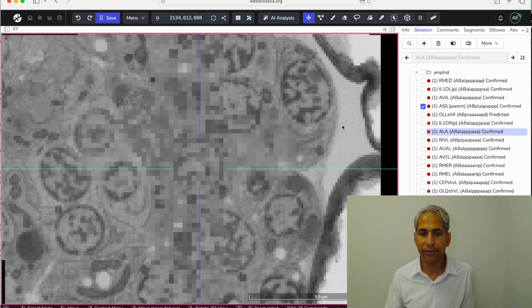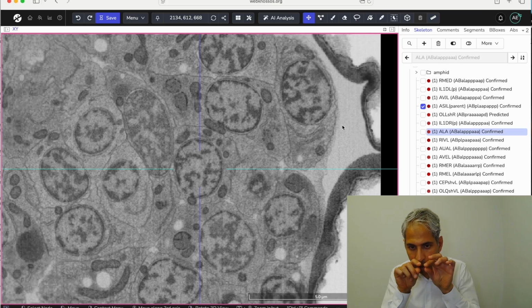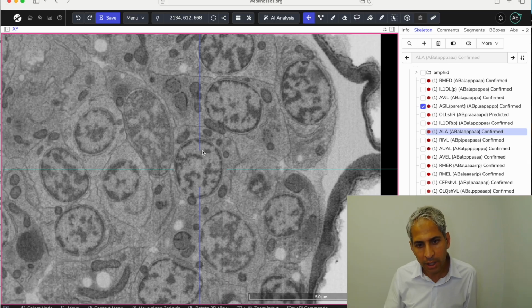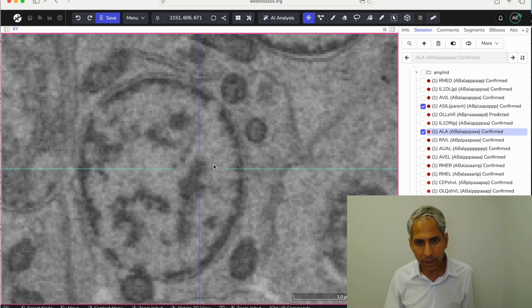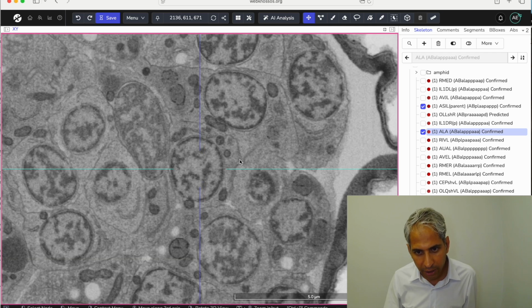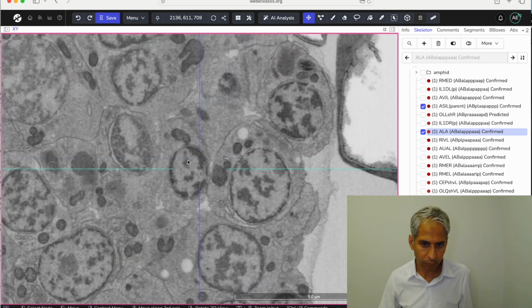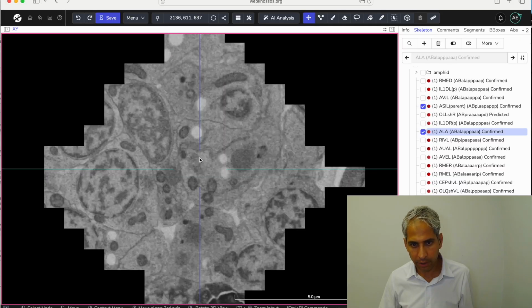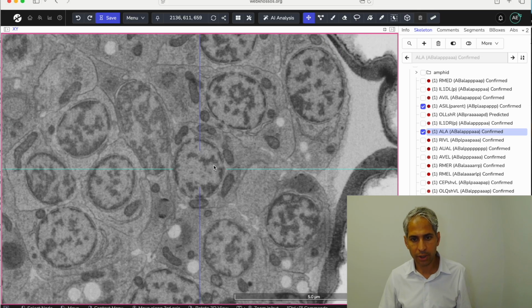That's an amphid neuron, one of the neurons that eventually is going to poke out of the nose so that the worm can sense its environment. Here's the nucleus of this cell. And let's zoom in. This is a relatively smaller cell. Here's the cell membrane I can see. Okay, let's look at the boundaries of this cell. Okay, from here to here. Oh, wow. This is the boundary of the cell. And so this is basically what we're looking at.